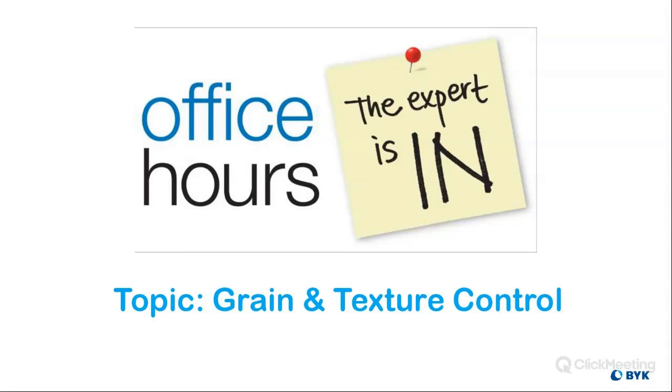Okay, next one here from John. Can you measure texture if the material is placed behind glass? For example, would the glass reflectivity mess up the measurement?